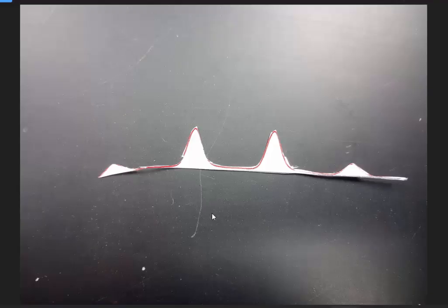That last factor becomes relevant and is probably best illustrated with this quartet peak here, wherein in the middle I had a sufficient amount of paper so that I could in fact cut along the line if I wanted to, but along the sides what I discovered is that the line essentially disappears altogether. And so I decided that I would try to ensure having a little bit excess paper on those sides. And then here in the middle I didn't quite hit the line that I wanted, but again, it's super challenging because I wanted to make sure that I didn't cut the peak off.